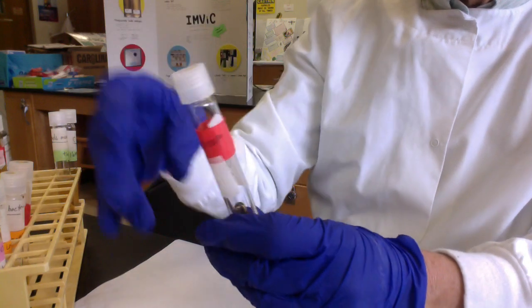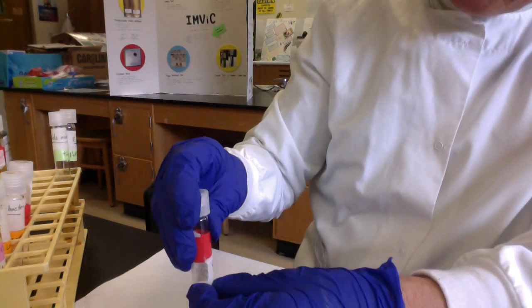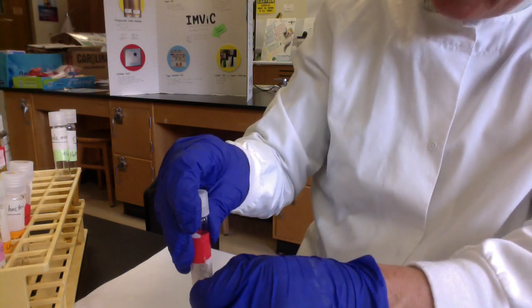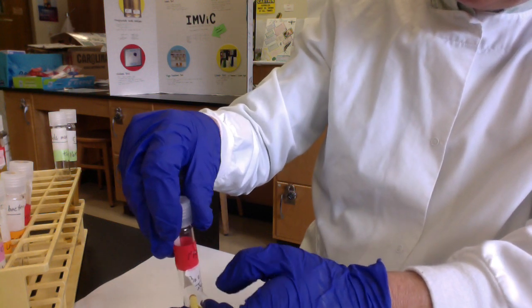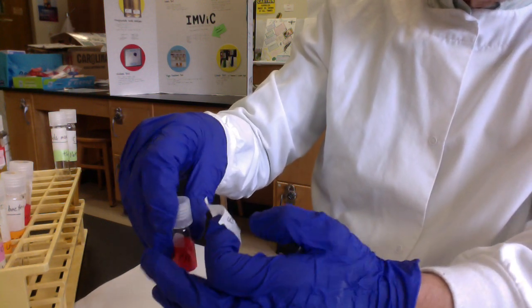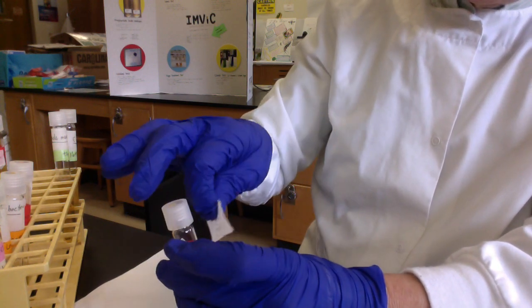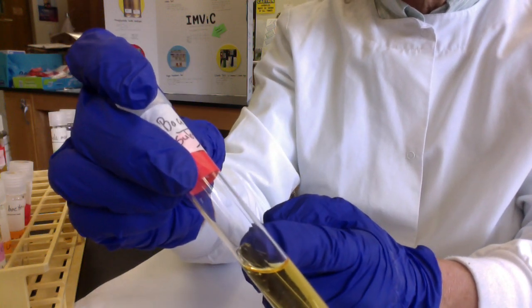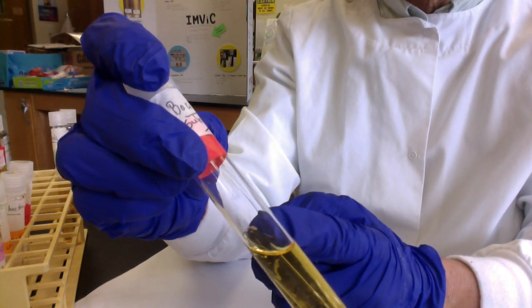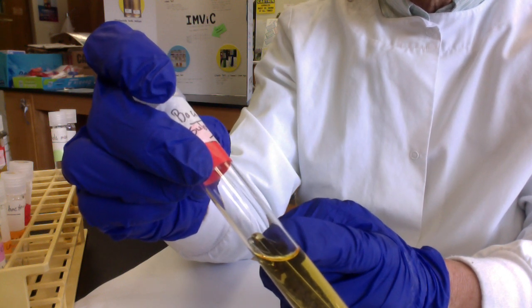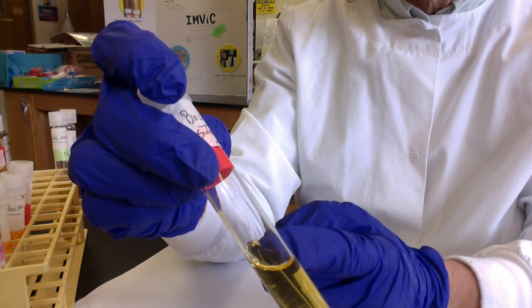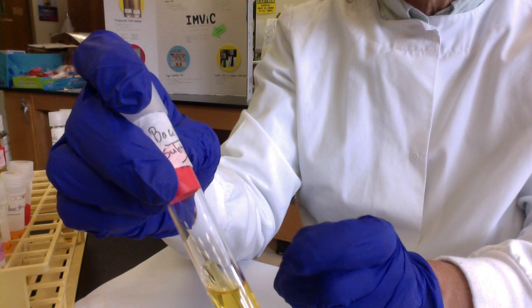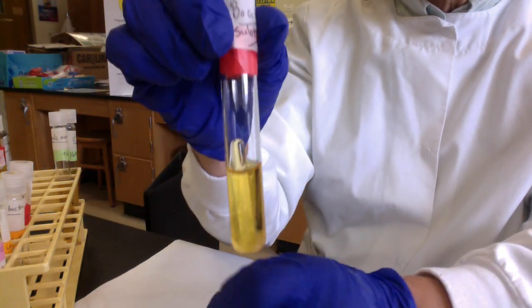This tube is Bacillus subtilis in sucrose. Bacillus subtilis makes sucrase because it's fermenting the sucrose. But there's no gas bubble. When Bacillus subtilis ferments sucrose, it doesn't make molecular hydrogen or CO2. We would score this A/- for acid but no gas—they use different fermentation pathways.